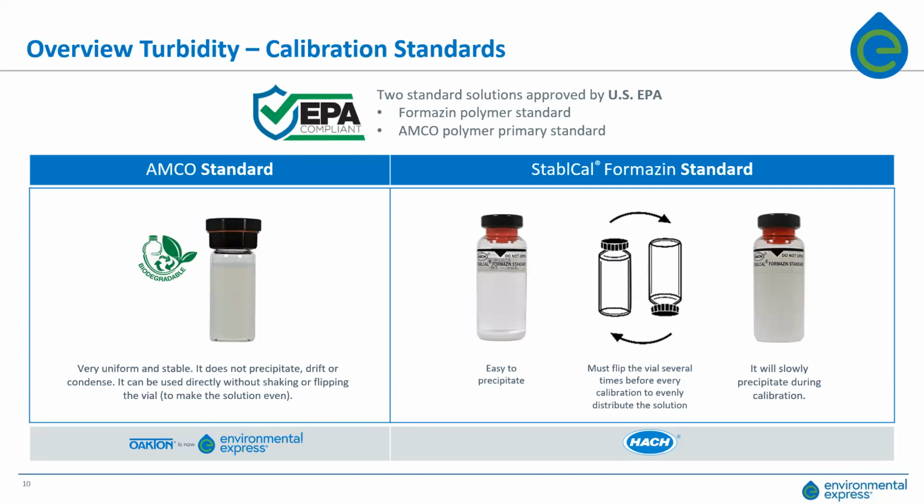In water treatment plants, with multiple turbidimeters, standardizing on one specific method or type of unit is commonplace, and maintenance, calibration, and validation requirements are all made much easier if they standardize on one type of equipment.